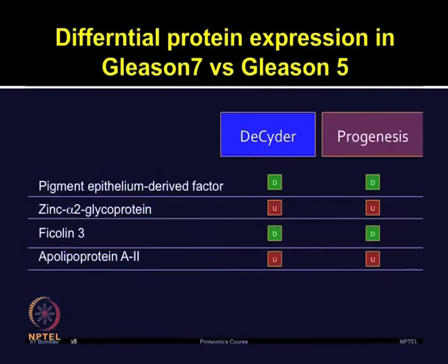Authors also tried analysis of these DIGE gels by using two different software packages, DeCyder and ProGenesis, just so that they are very confident that all the proteins which they are going to analyze by mass spec are very reproducible.